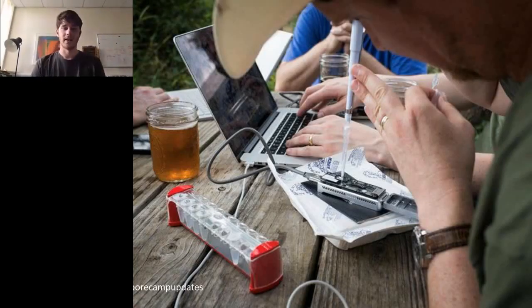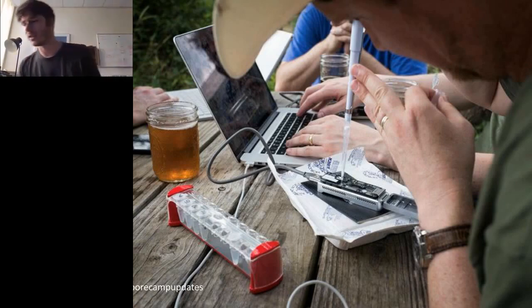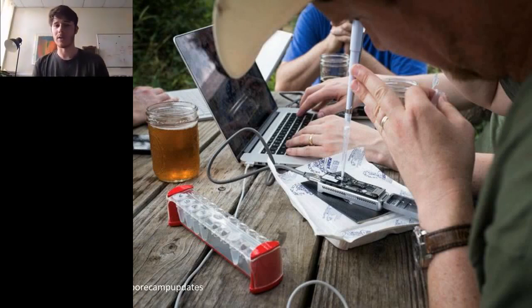So, to give you some examples of some mobile sequencing, this is us at a brewery in Austin, Texas, at the Jester King Brewery, doing some analysis on some spontaneous fermentation beers, and we're actually able to take everything down there. It's a sort of hobby of ours, really. It's more of a public engagement activity, and we like to look at fermentation and the microbiology involved in fermentation, and do it right there and then in the field.